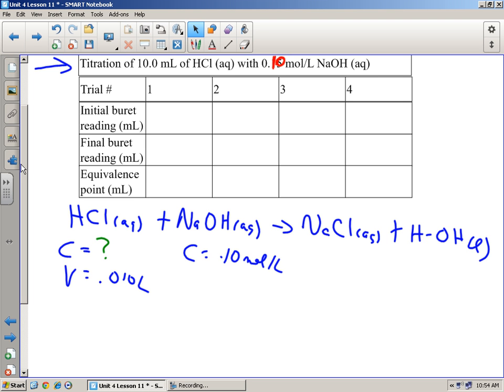Okay? So what I suggest is you take your fingers and you just put them on top of here, like so, and that just creates a little bit of an air break there, and you can simply dump in the sodium hydroxide. Obviously, make sure the valve is closed, otherwise it just leaks out the bottom, and we have the same kind of problem as before. You need to fill it up past 0. Okay? Past 0. So make sure you guys write this stuff down.